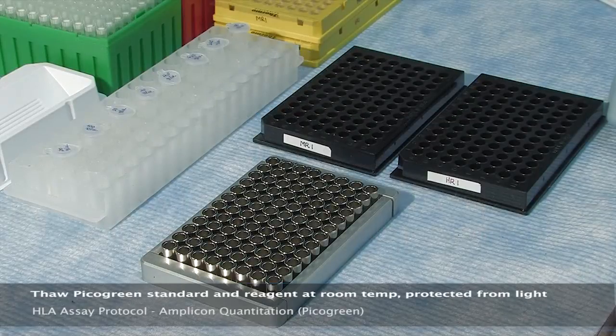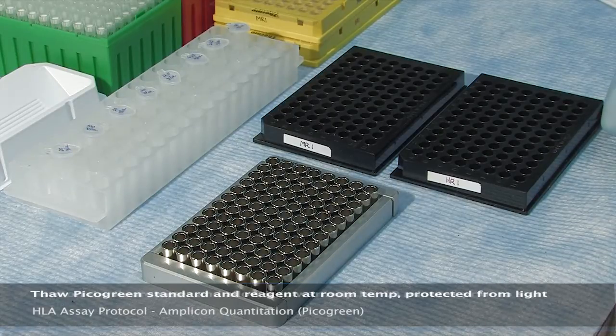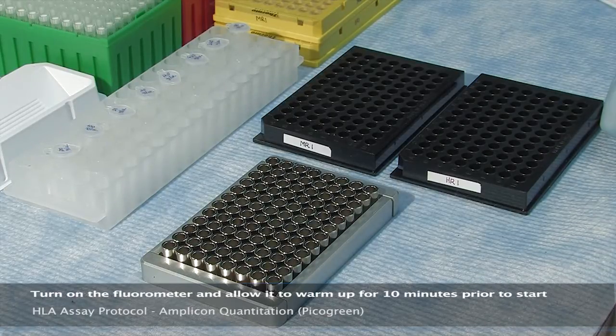To begin the amplicon quantification process, thaw the PicoGreen standard and reagent at room temperature protected from light. Turn on the fluorometer and allow it to warm up for 10 minutes before proceeding.